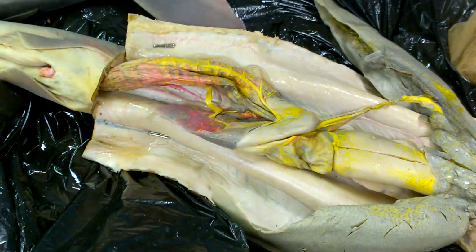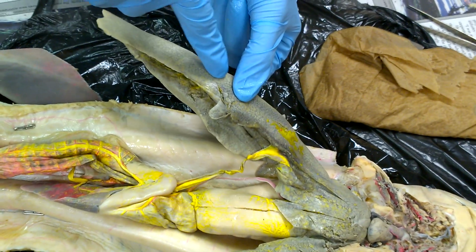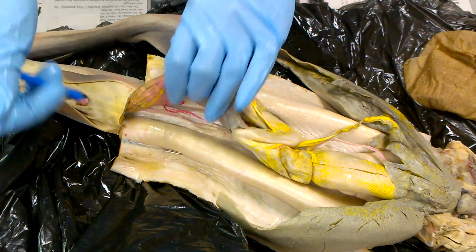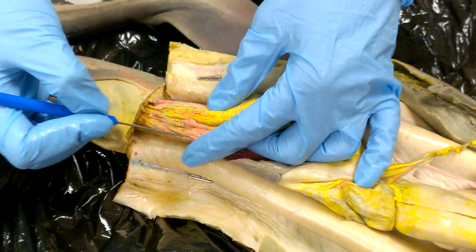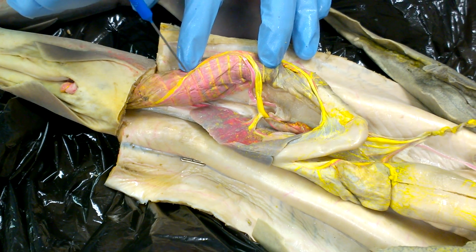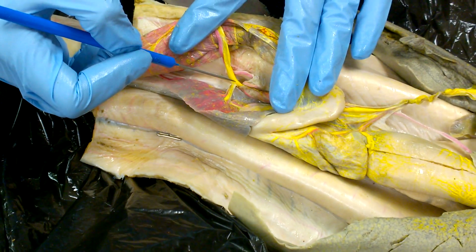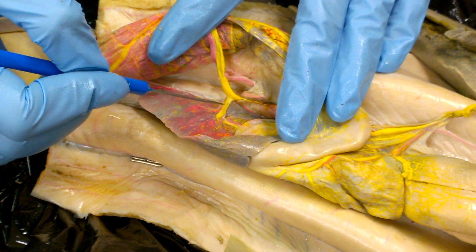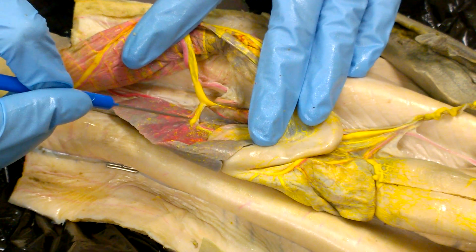Okay. All right, so then we're going to take the blood back from the digestive system. All of the digestive blood goes through the liver. Okay, so we're going to start here at the back of the shark. So what are these little veins that wrap around them? Annular veins. Great. And then here they empty into the posterior intestinal vein. Perfect. So it's going to come up to right here, and then this little short vein drains the back of the spleen. The posterior splenic vein. Perfect.